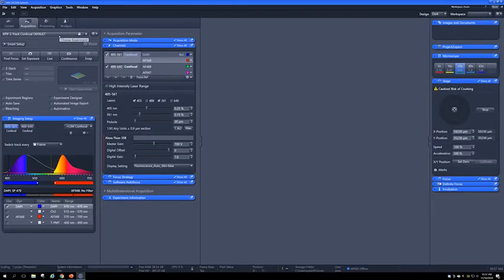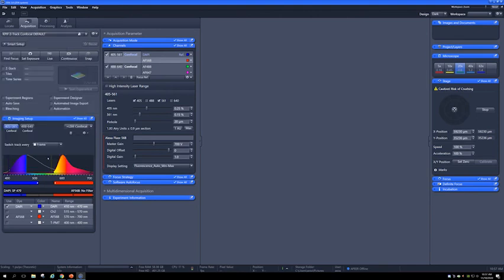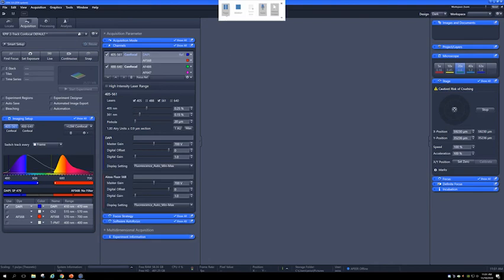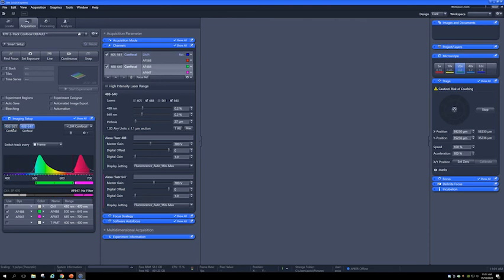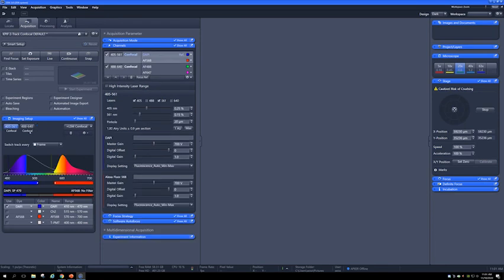If you are imaging on this instrument for the first time, start with the KPIF 2-track confocal default settings. The default settings consist of 2 tracks, which is analogous to sequential scanning on the Leica confocal. You may add or delete tracks. You can also add or delete collection windows, which correspond to separate detectors. Be sure to add or remove corresponding lasers in the channels window.